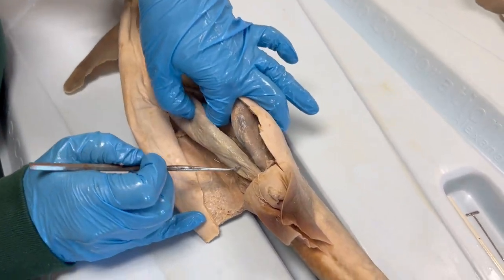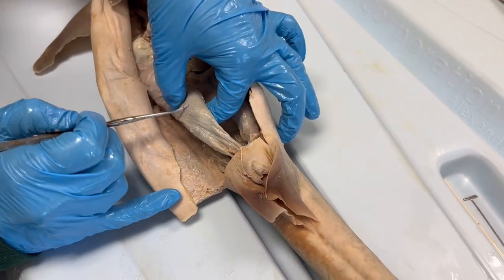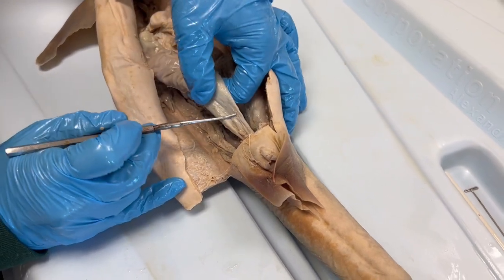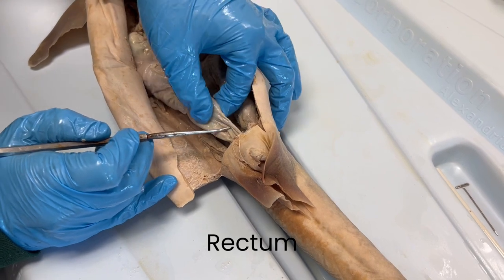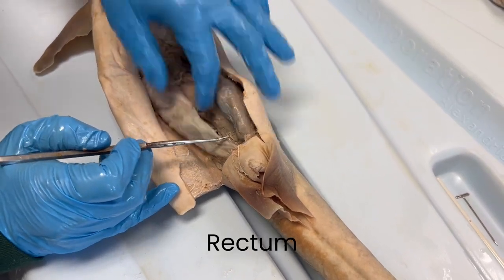Caudal to the intestine, after we lose all the blood vessels and internal spiraling tissue, we have the rectum. That is where solid waste forms and is stored before elimination through the cloacal opening.